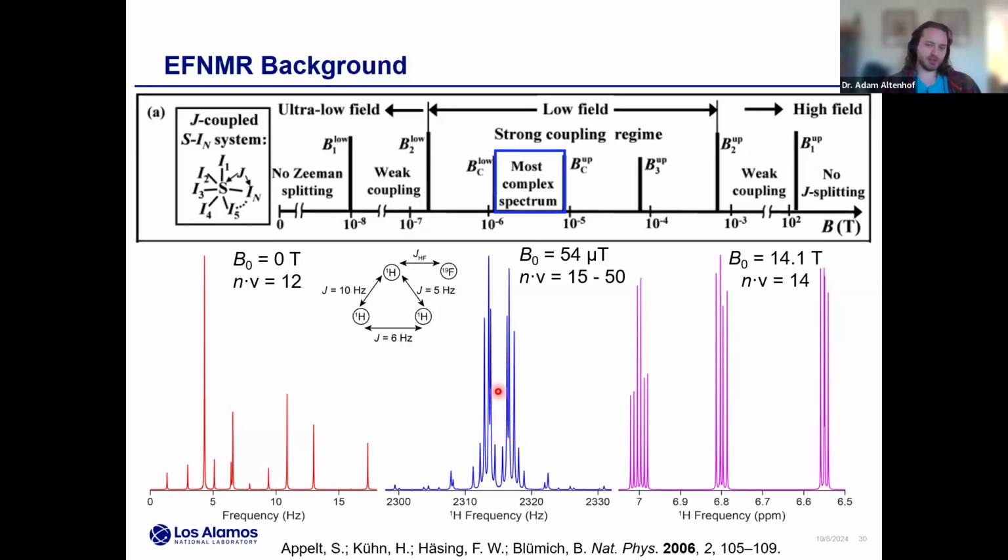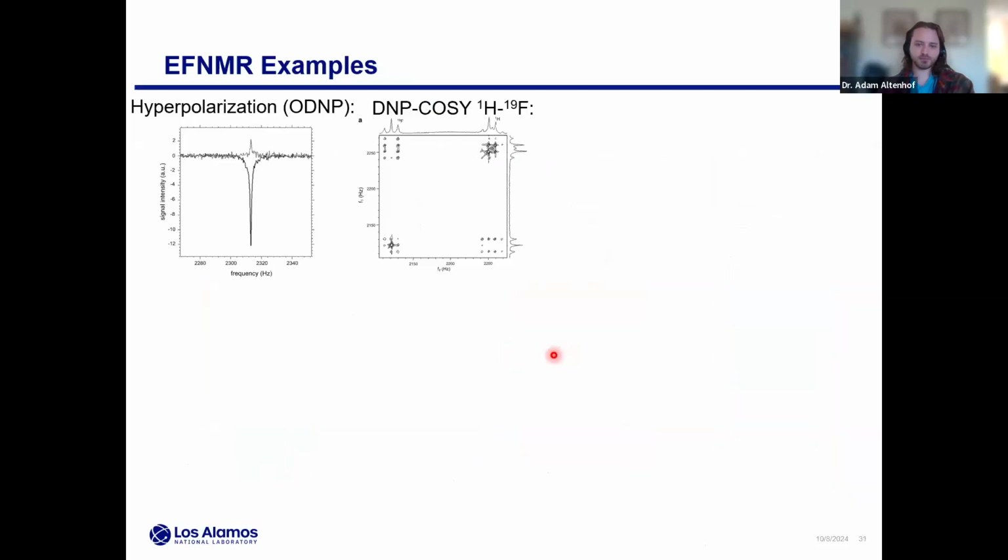And then at Earth's field, again, it depends how you count it. If you take this symmetric half, that would be 15. Really, this is 30 about the Larmor frequency. And then if you count the 19F spectra as well, that's a total of 50 peaks. So, describing the same spin system. Really the motivation is, if we have this ultra high resolution and this really complicated spectrum, that should be a very good spectral fingerprint for illicit materials.